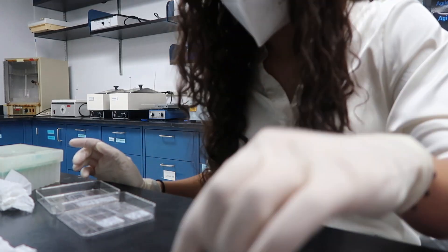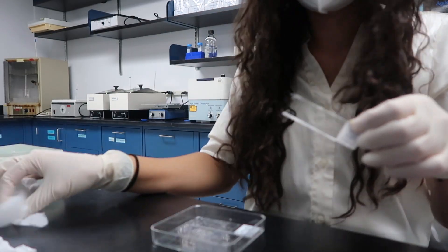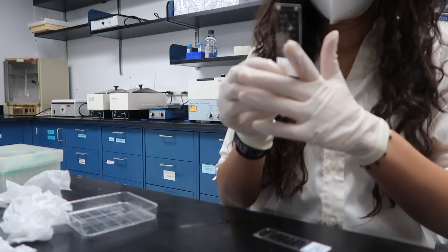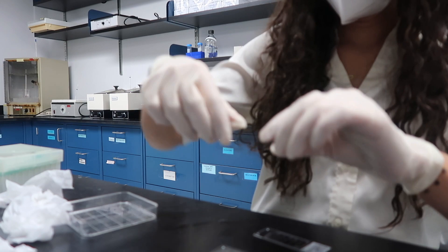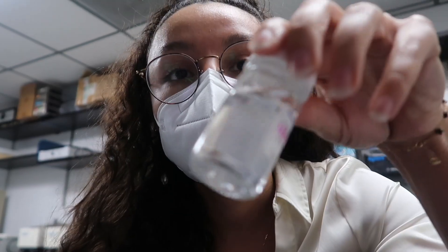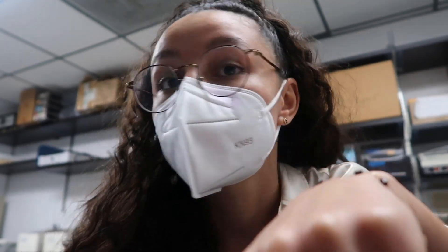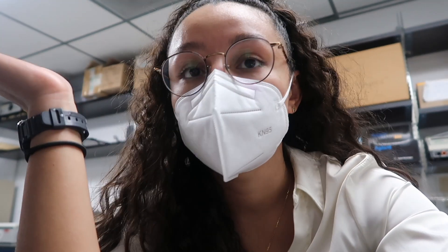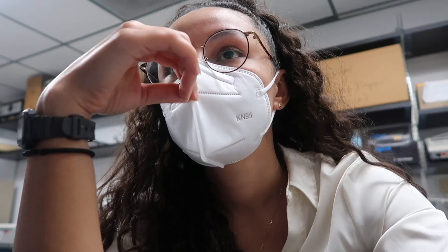Oh wait, these have slides on them — did I do all of them? Alright, now I just let it dry and then I put them on the Zeiss. I just messed up so so bad. I was supposed to be applying this Southern Biotech Floramount, but instead I pipetted Triton. Oh my god. I tore every single coverslip off and started washing immediately. I'm hoping this immuno turns out okay. This is what I mean when I say every step of the immuno is the most important step — this is the easiest part, but I made one mistake and it could ruin the whole entire two-day experiment.